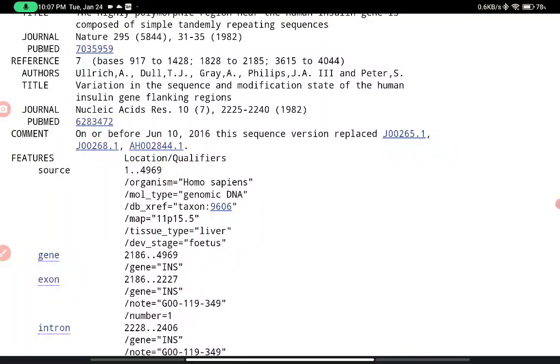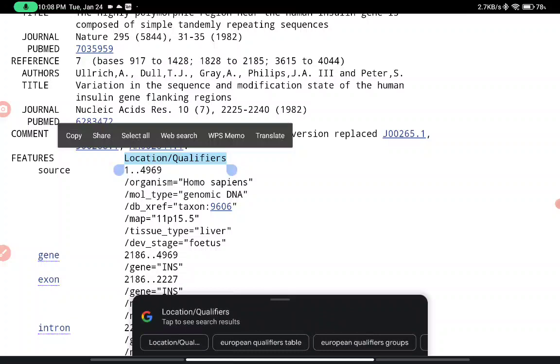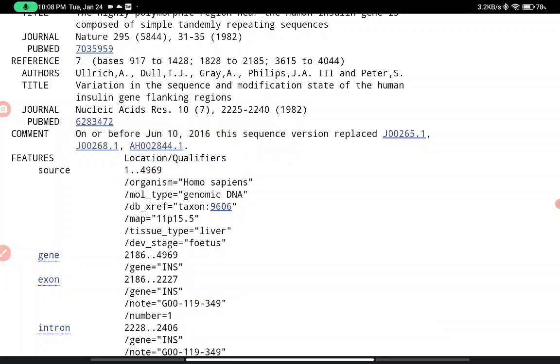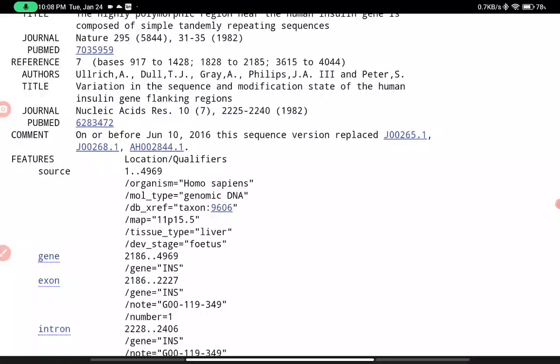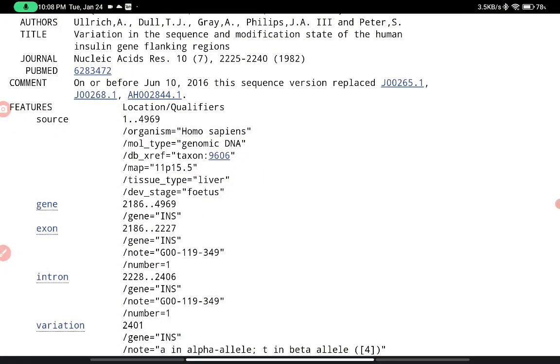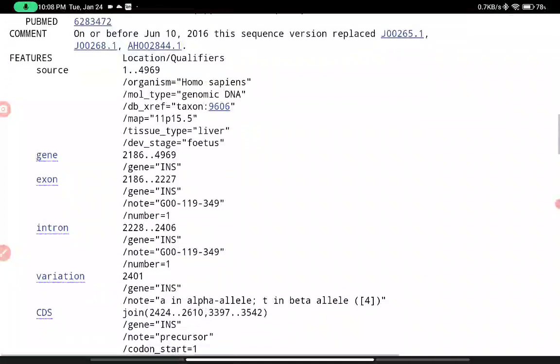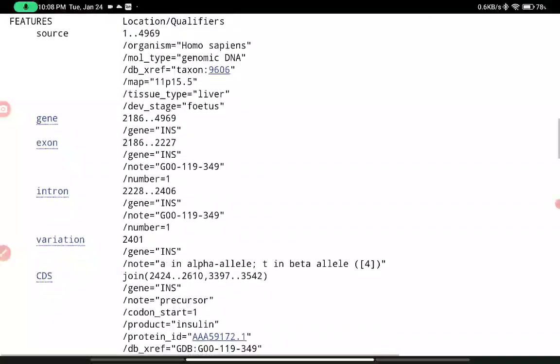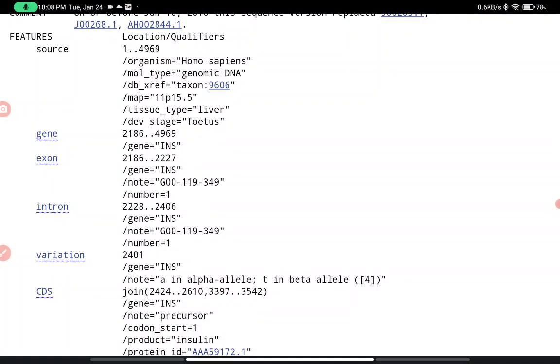The second major section is Features, which consists of location and qualifiers. In this case, the source spans positions 1 to 4969. The organism name is Homo sapiens, the molecular type is genomic DNA, the taxonomic ID is 9606, and the chromosomal mapping is given as chromosome 11, position p15.5. The tissue type is liver and the developmental stage is fetus.